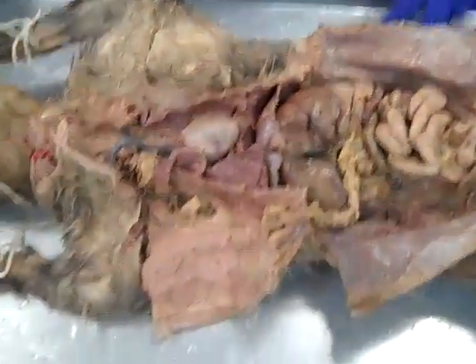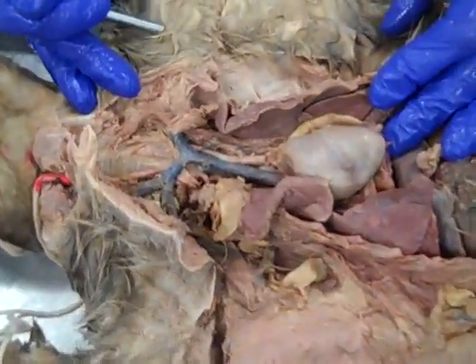Hey, let's get started. We're gonna do the organs of the cat today. So we've got our cat down here, and what do you say we start up here in the thorax?